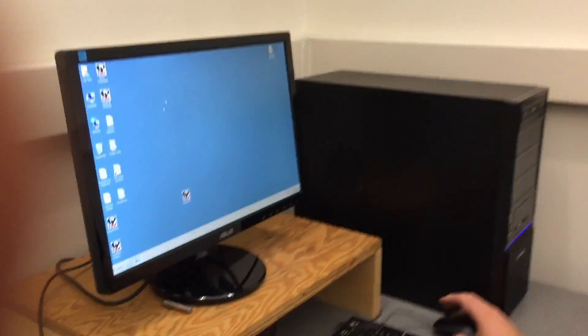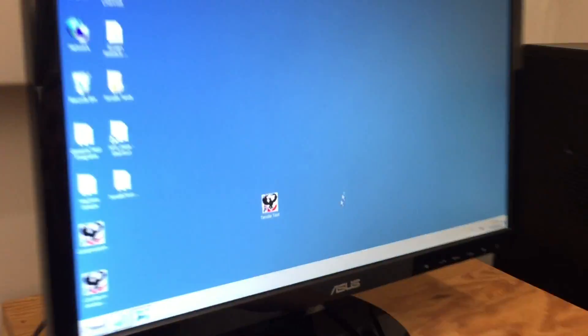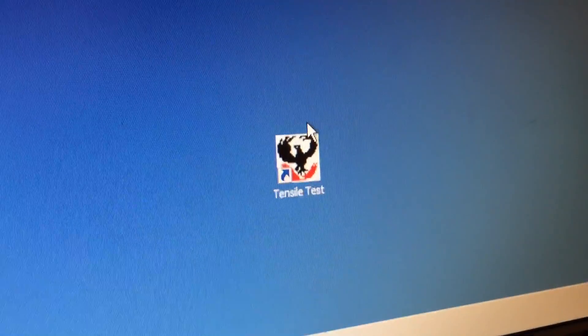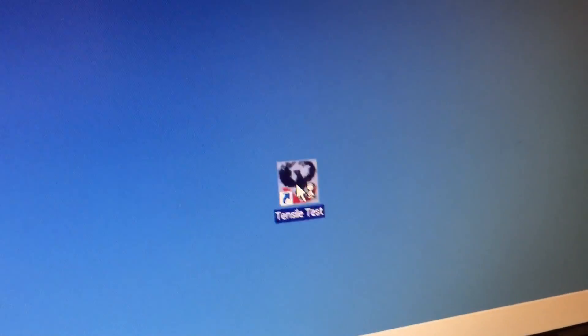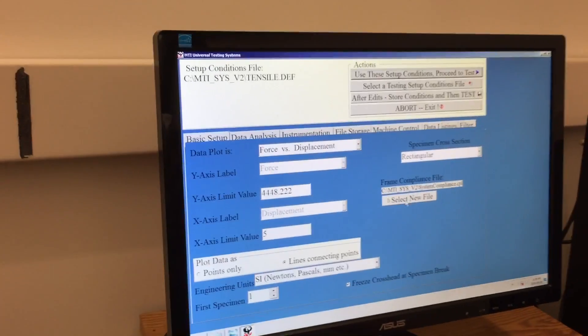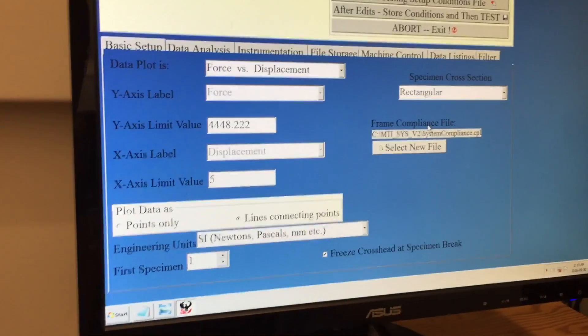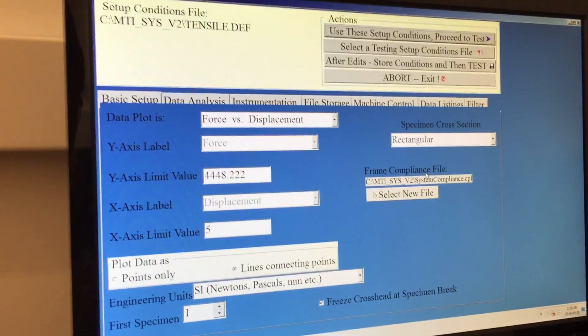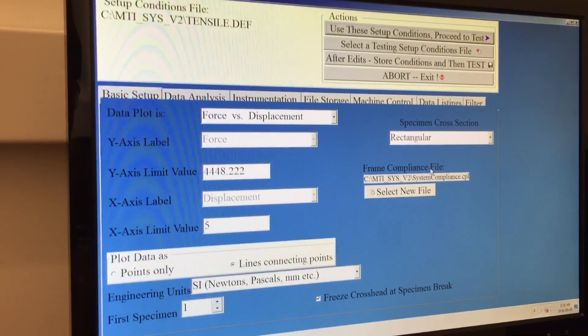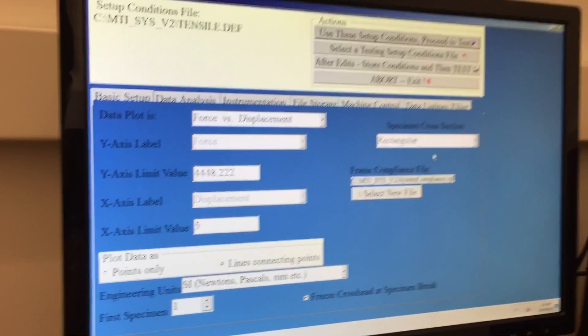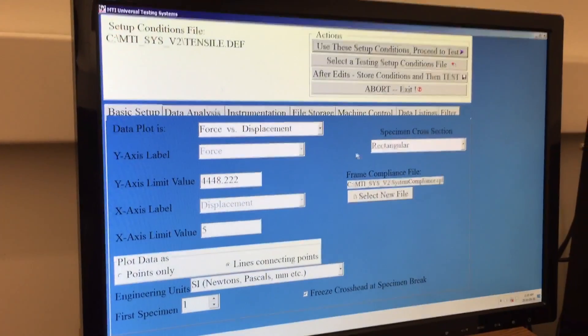The software that interfaces with the MTI is just called Tensile Test. It's sitting right here on the desktop. The default settings that it has are sufficient for this test as they're meant for the aluminum test specimens.